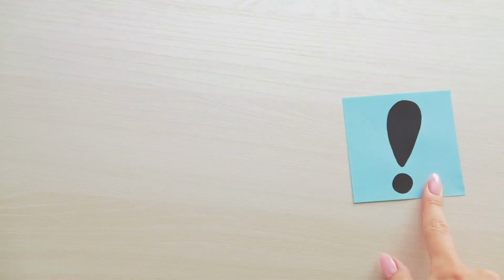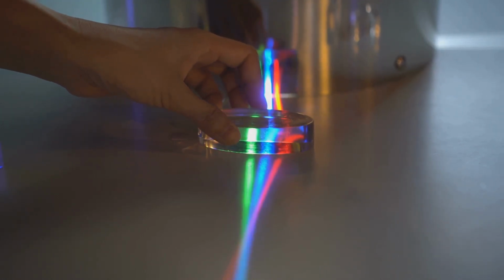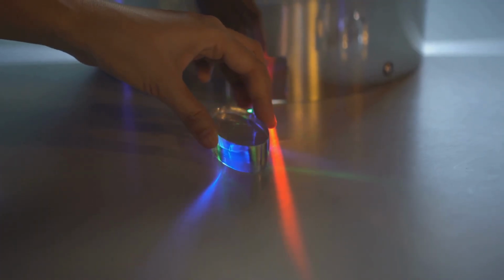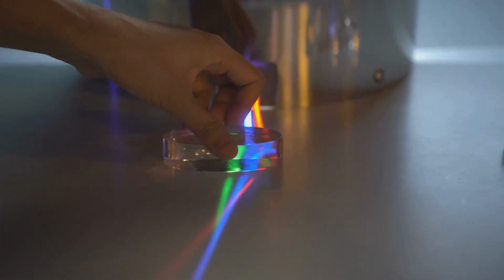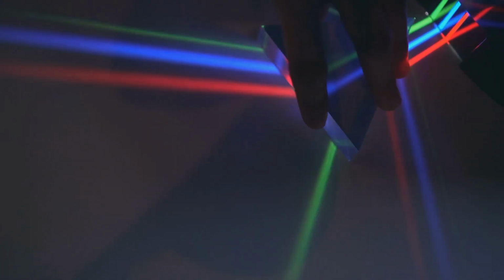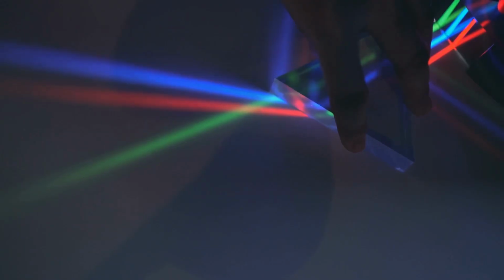By the way, it's good to quickly remind ourselves how a prism or grating works. As you may know, a prism separates colors because different wavelengths of light bend or refract by different amounts when they enter and exit the glass. Shorter wavelengths bend more strongly, and longer wavelengths bend less, so the prism literally spreads the beam into a rainbow by slowing each color differently.